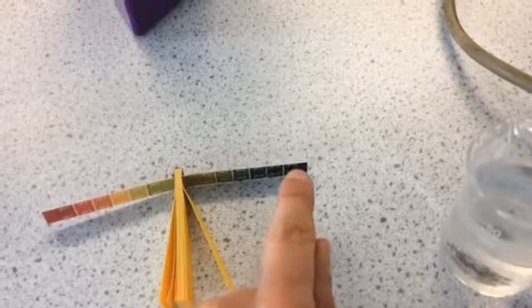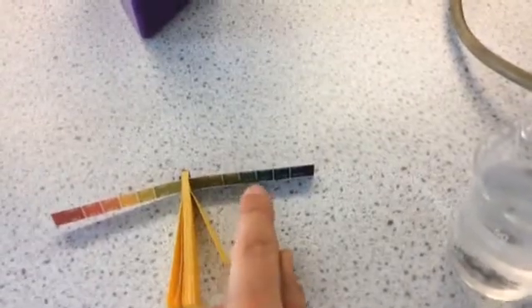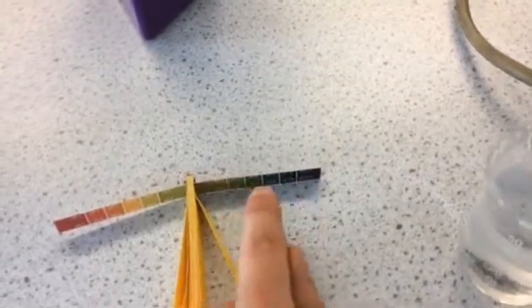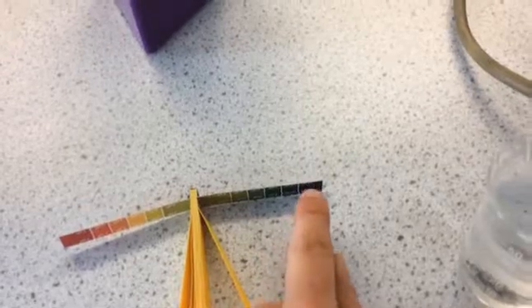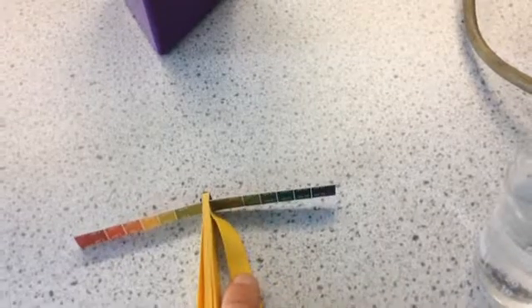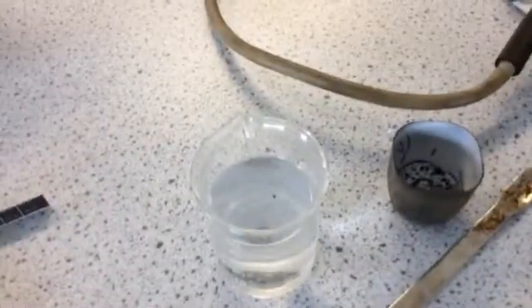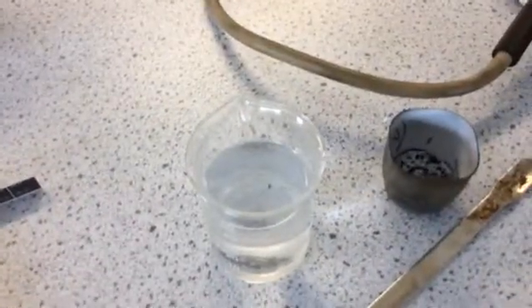And the more alkaline it is, the darker that blue will be until you get the purple, which is the strongest alkali. So depending on what color this yellow strip turns when we put it into here, that will tell us whether it is an acid or an alkali.